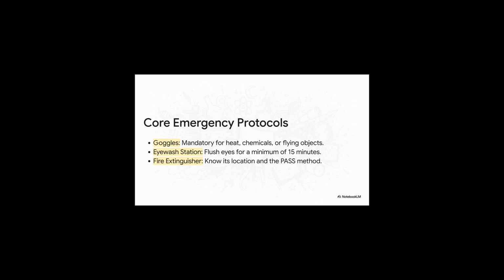So how does duty of care look in action? It looks like knowing your emergency protocols cold. I mean, these are the absolute non-negotiables. Goggles, they're on anytime there's heat, chemicals, or even tiny things flying around. You gotta know exactly where that eye wash station is. And remember, a splash isn't a quick rinse. We're talking a full 15 minutes of flushing.